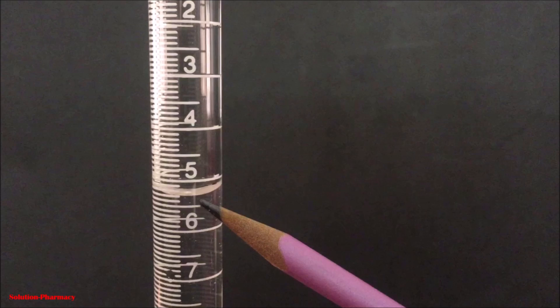As you can see here, the lower meniscus of the liquid touches the line 5.3, so the volume of liquid consumed during titration is 5.3 ml.